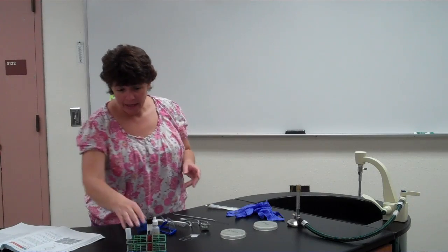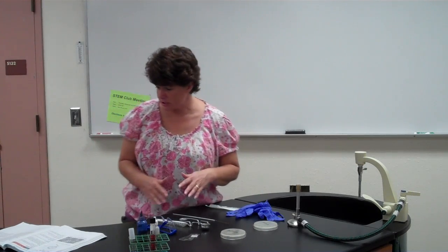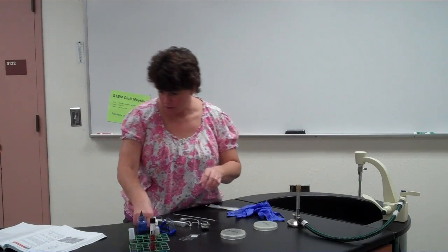So the first thing that you're going to do is each group is going to have the 5 yeast. They're going to be growing on plates most likely. So they'll be on a specific plate that grows fungi. And then you're going to have fermentation tubes. So because you have 5 of them, you will have 5 fermentation tubes of each kind. Okay? And then you're going to have some sterile saline, and you'll have some other plates. So let's go ahead and just get started with the whole procedure, starting with the first part, which is just looking at the yeast under the microscope.